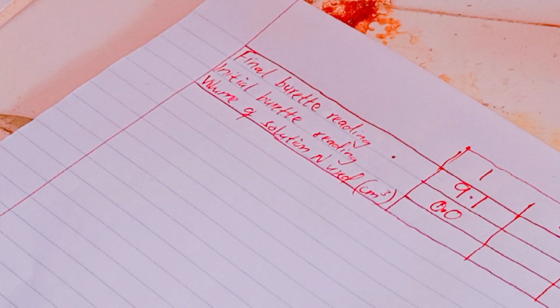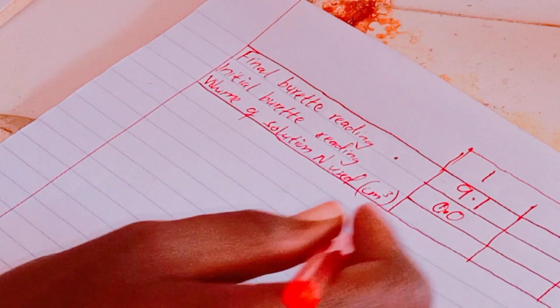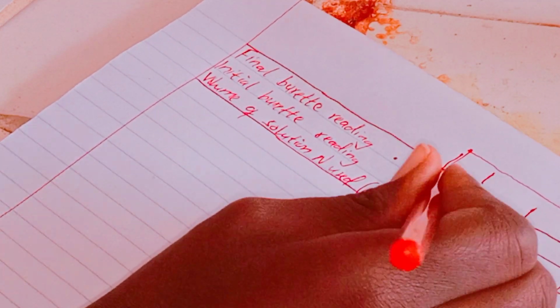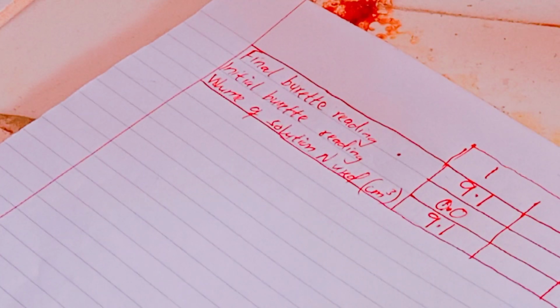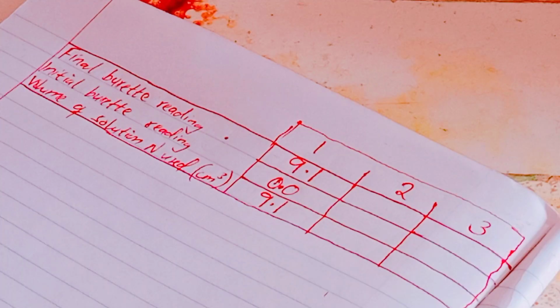Now for you to get the volume of solution N used, you subtract final minus initial. That is 9.1 minus 0.0, which is 9.1. Now for the second experiment, you refill the burette with solution N, so it becomes 0.0.